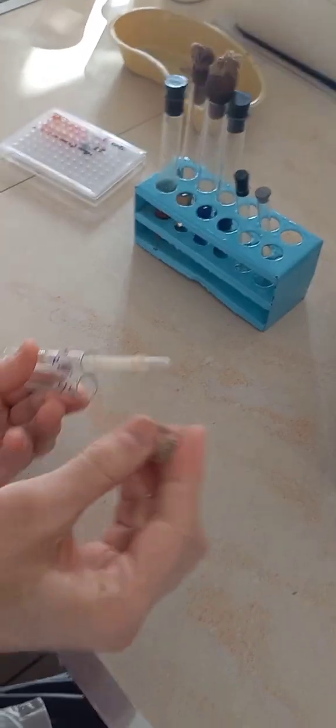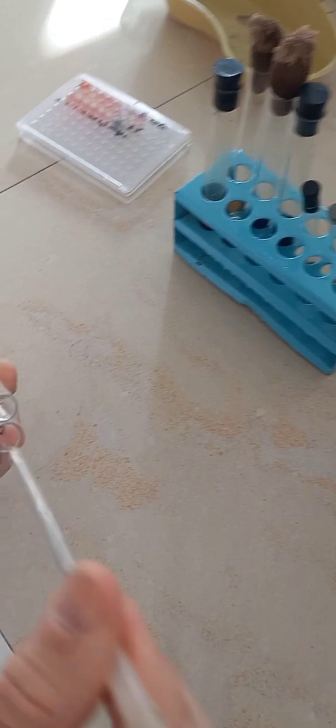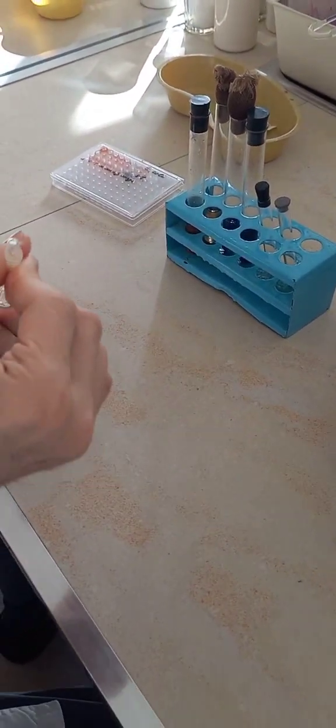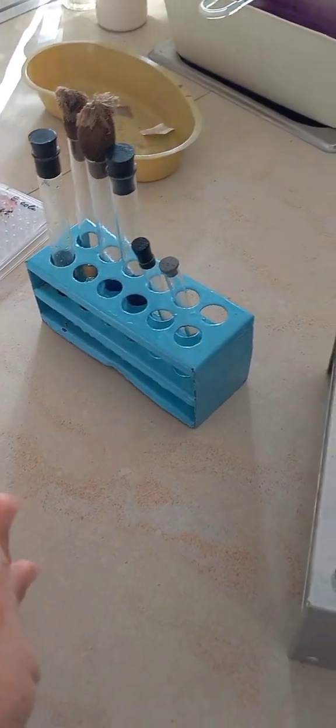Maybe we'll see something more typical. No, here much more intensively. Maybe our hydrogen peroxide already self-decayed, who knows? But to the end of the working day, possible. But bubbling now, now it's finally starting. You see, sometimes it is an exothermic reaction, sometimes even heating is possible. Do you see?